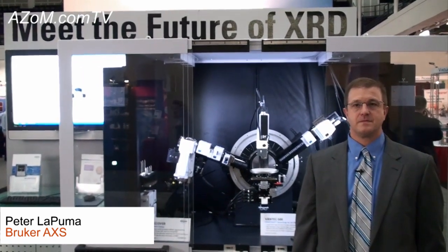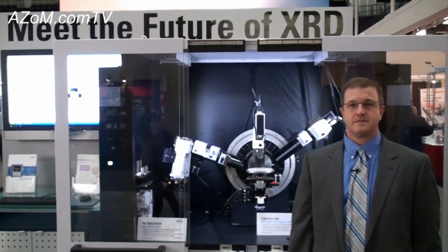This is Cameron Chai from azom.com, bringing you another episode of azom.com TV. Today we're speaking to Peter Lapuma from Bruker AXS, and he's going to tell us about their new D8 Discover X-ray diffractometer.